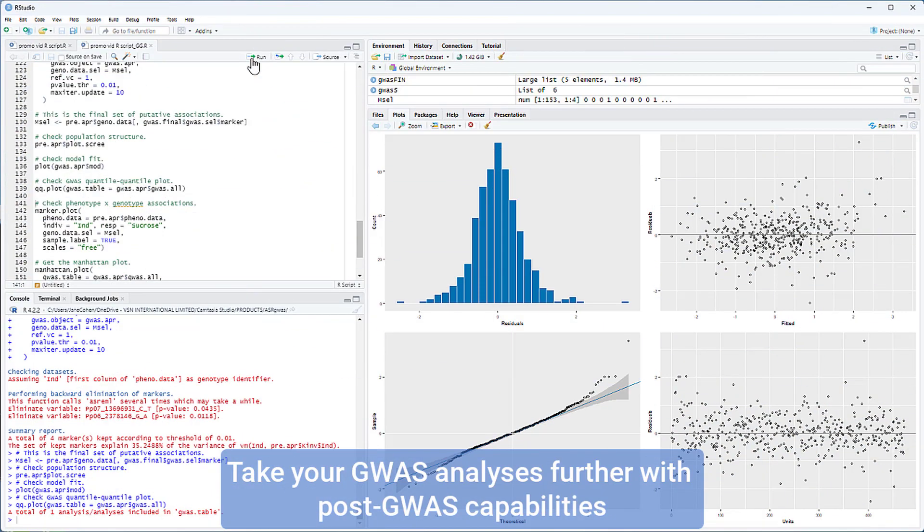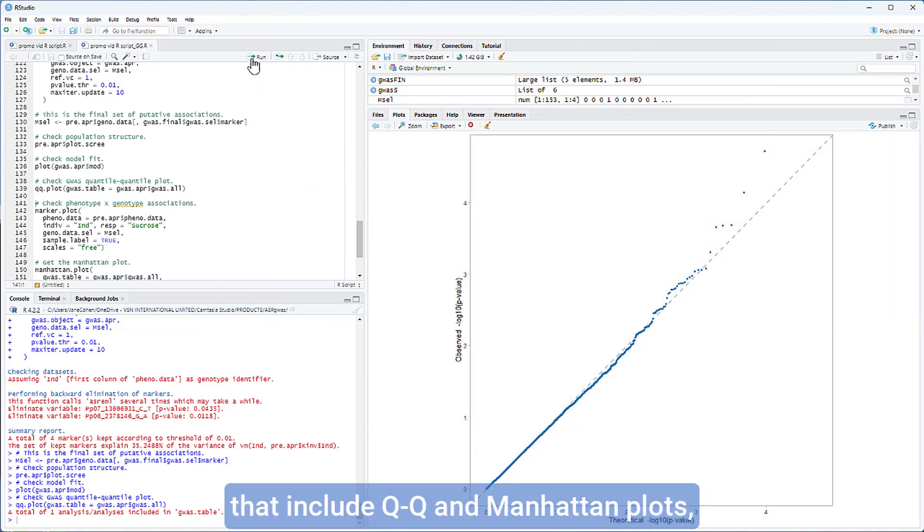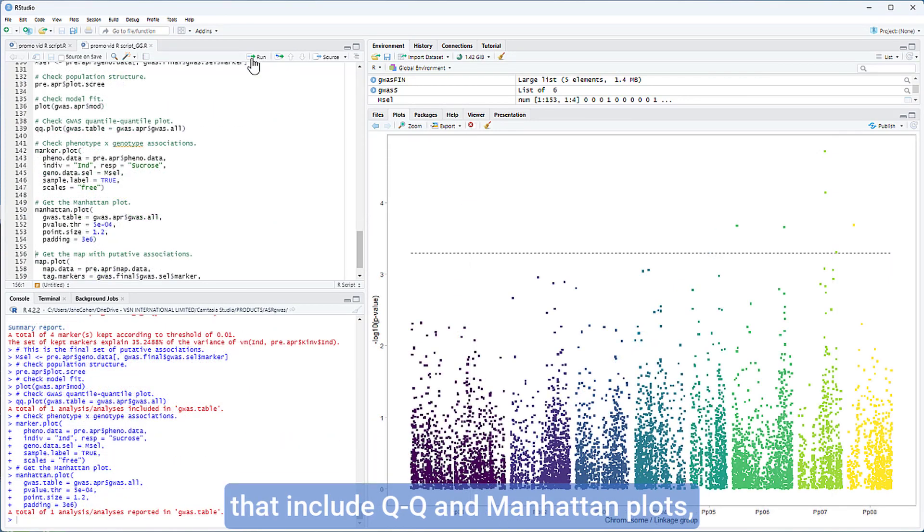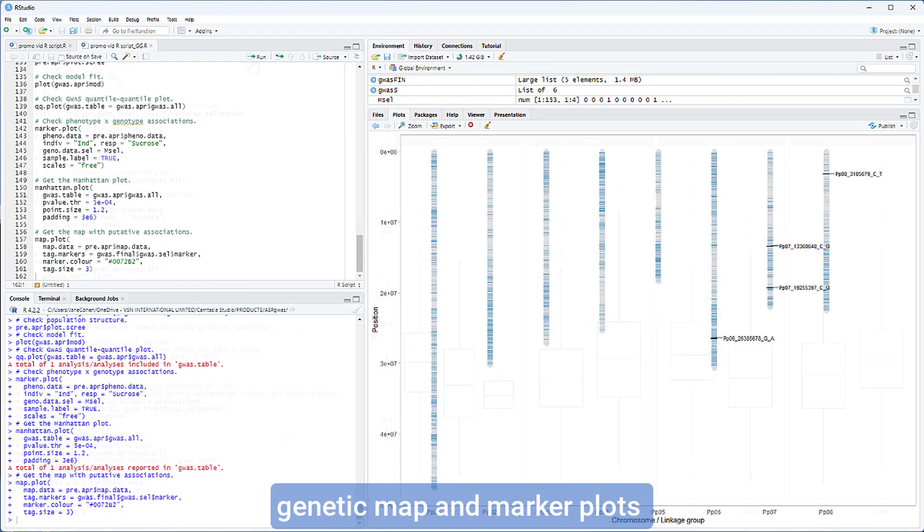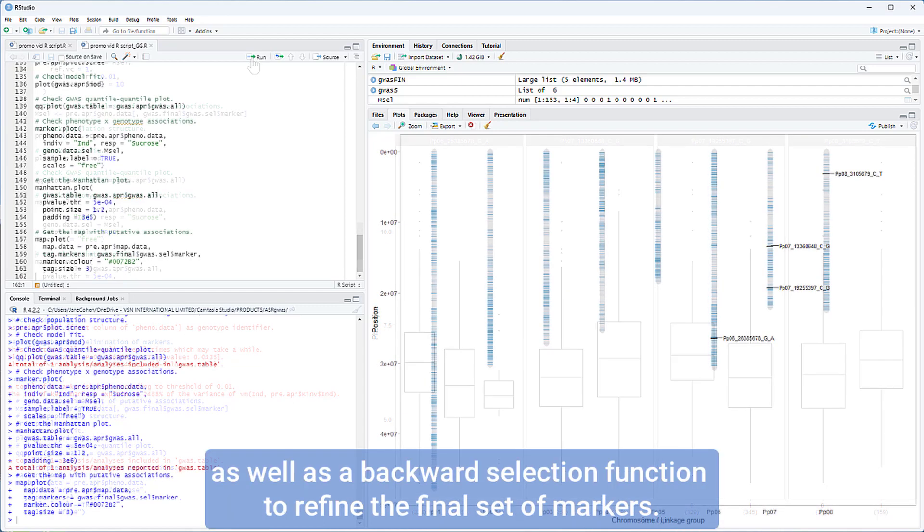Take your GWAS analyses further with post-GWAS capabilities that include QQ and Manhattan plots, genetic map and marker plots, as well as a backward selection function to refine the final set of markers.